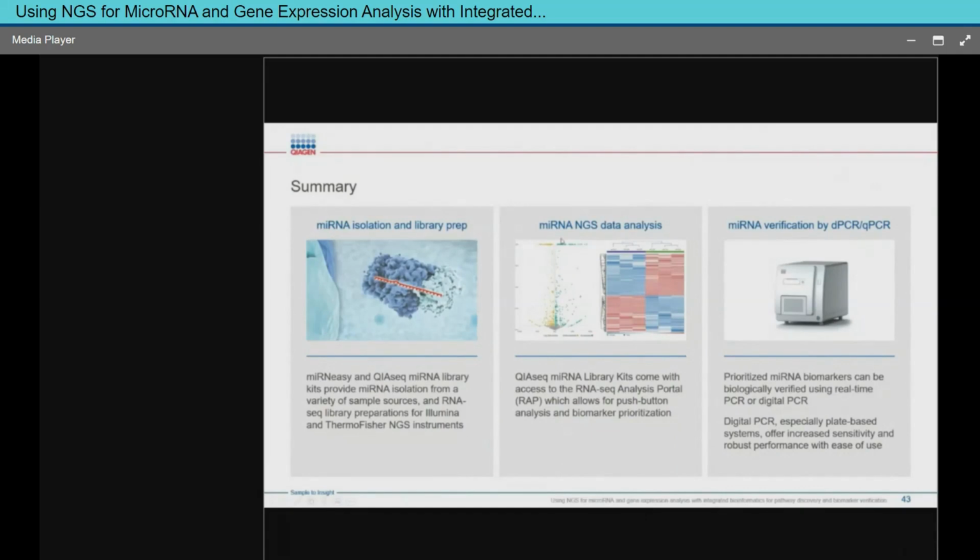Once you've done the alignment, you can go back and you can compare any sample as many times as you want. Your data actually gets stored within that website. So that's why we ask you to log in. So anytime you go through, and if you think about a project, the project I showed you were 6 samples. That was my first 6 samples I had ever done. We used the MiSeq. I was really happy about it, but it's not the end of my experiment.